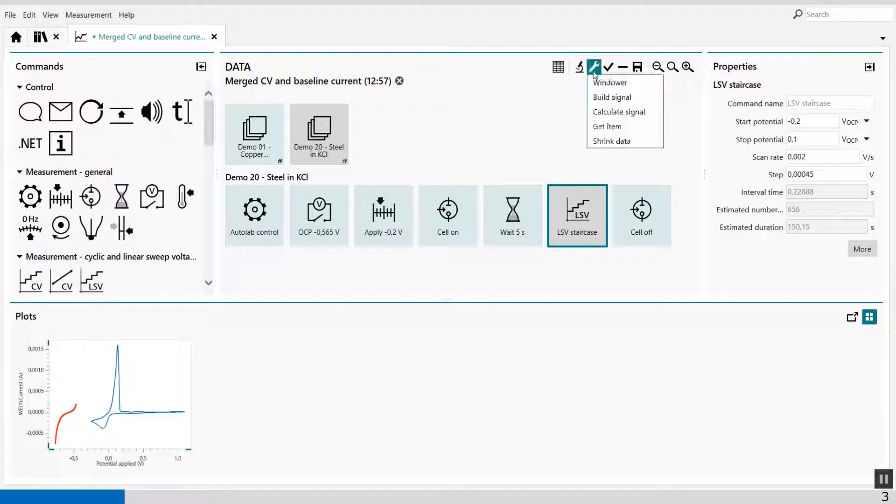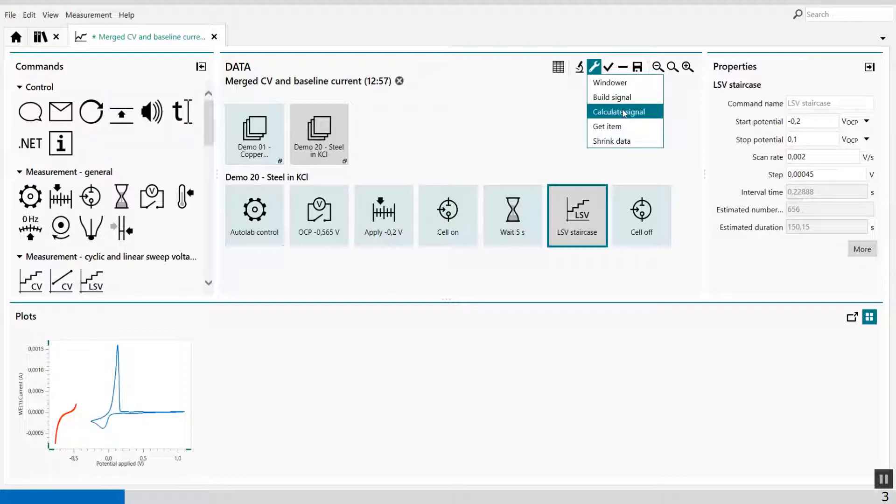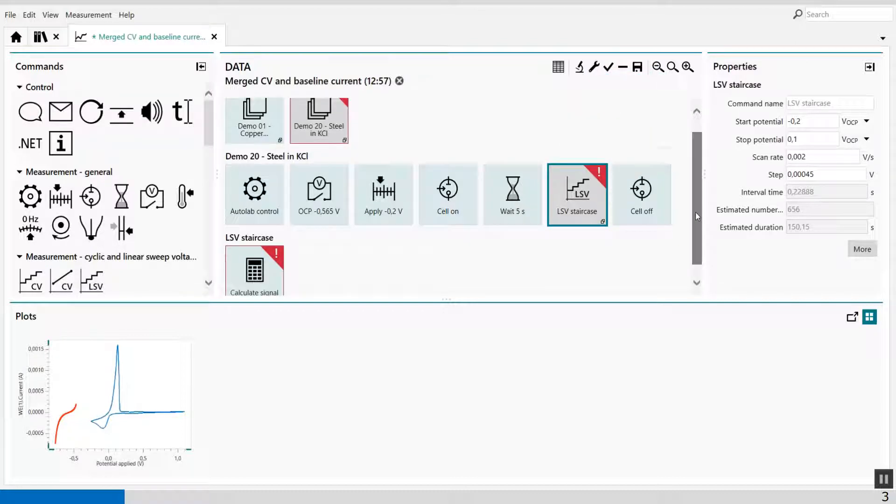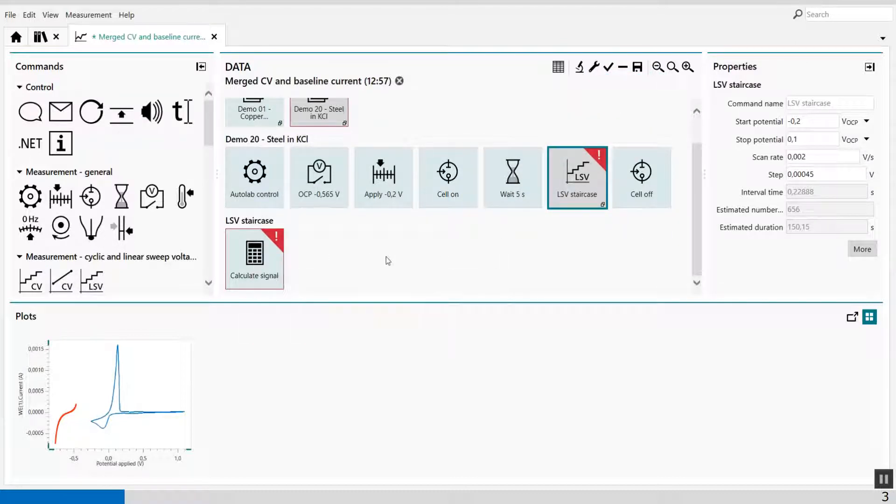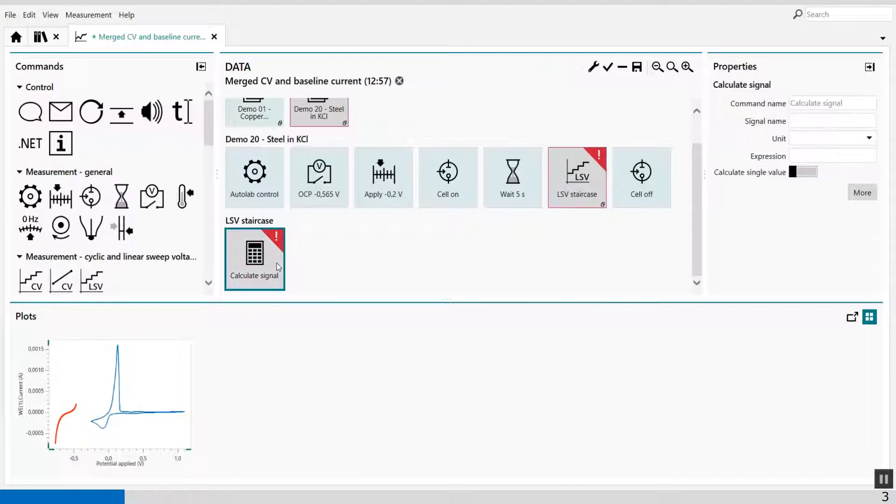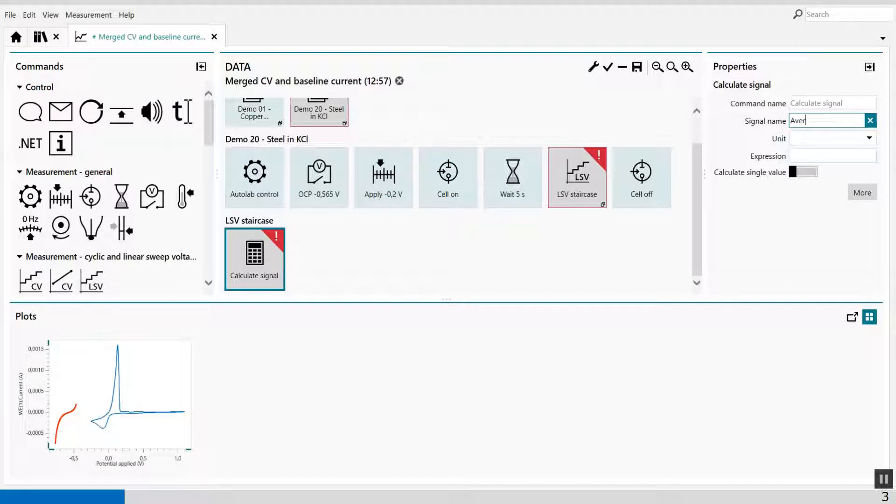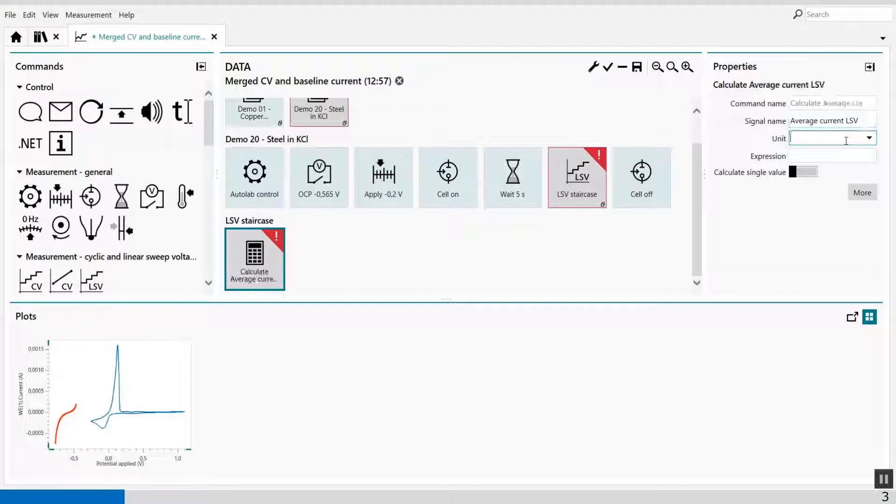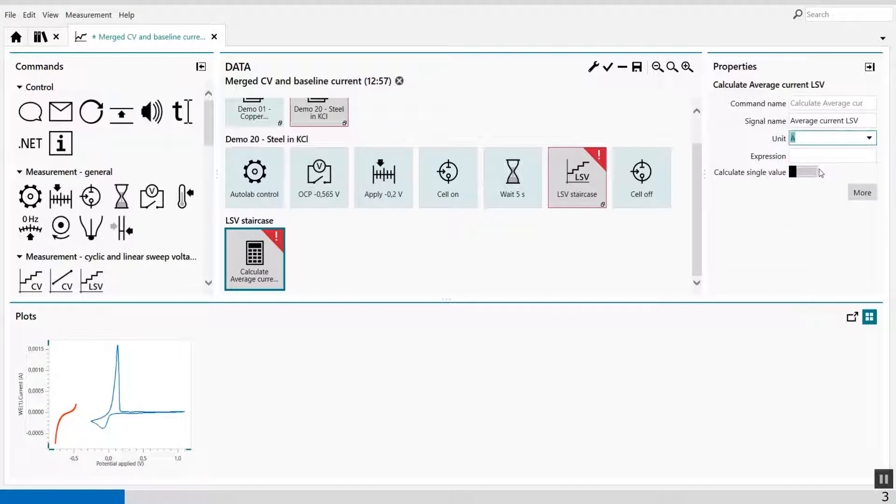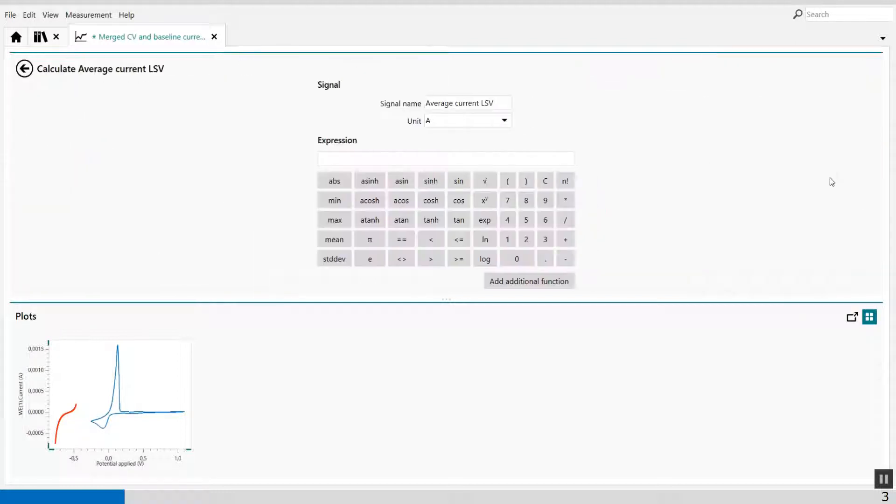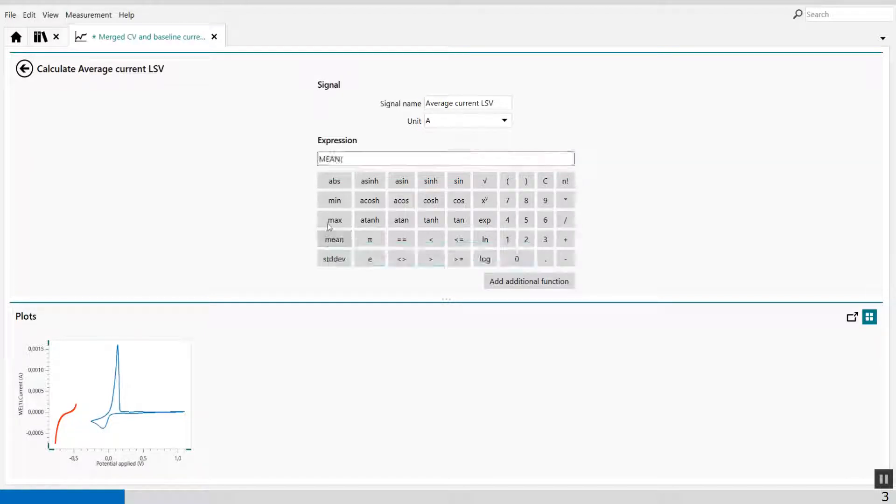And the calculator is in this control command, calculate signal. And in the calculate signal, we can calculate the average current. We can give it a name, average current of the LSV. It's in amps. And then I give it an expression. This expression is the mean value of the current I.